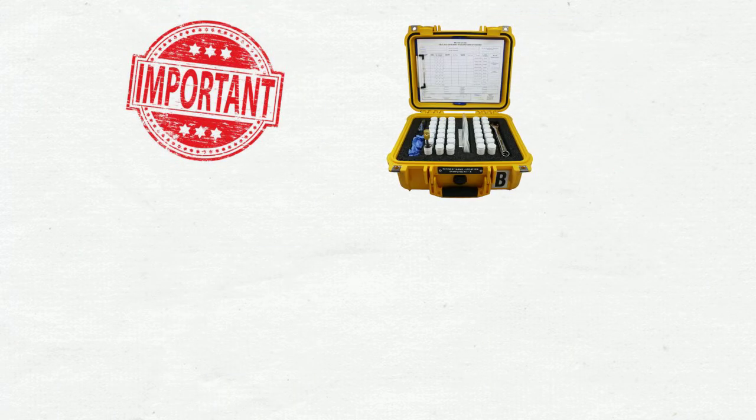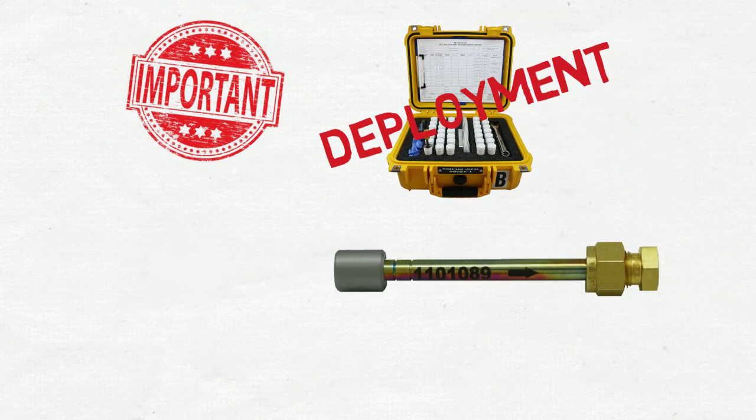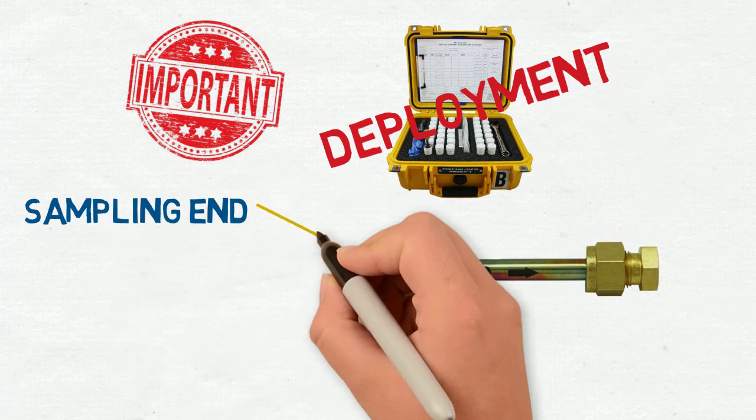The most important part of deployment is the passive sampling cap installation on the sampling end of the tube. So let's get to know the tube inside and out.